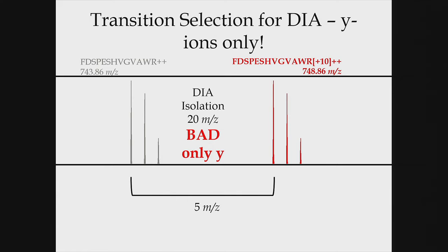So in this particular case, for quantification of this peptide, we would have to only be using the Y ion series. That's not too much of a drawback on the Q-Exactive because in the case of looking at peptides, you're going to be using HCD, and largely what you see are Y ion fragments anyway. So that's kind of a stroke of luck. But it's something to keep in mind when you're looking at some of these experiments.